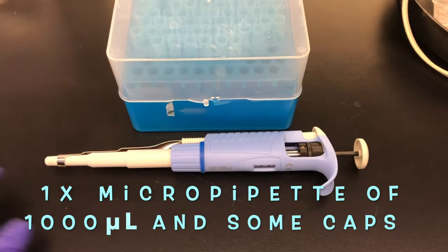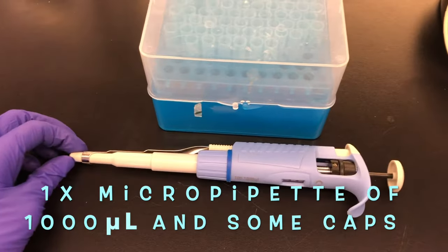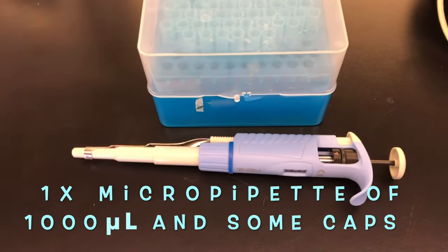We will also need a micropipette of 1000 microliters to pipette our desired volume of glycerine as well as our desired volume of NaOH.